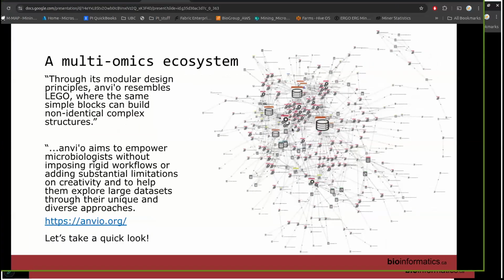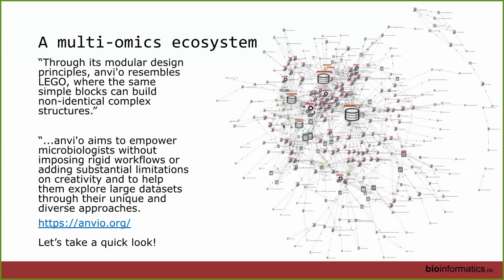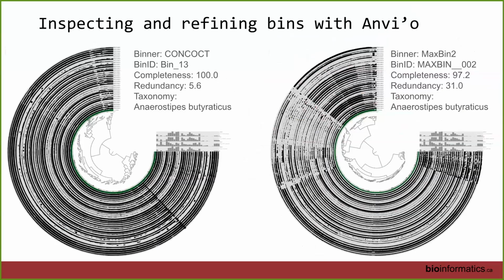Okay, so Anvi'o is cool. We're going to be doing that today. This is a figure that you're going to be creating. Not exactly these figures, but something very similar to these figures. Maybe exactly, depending on what journey you take today during the lab. So what these are is a visualization of a genome, of a MAG, actually. Well, actually, we should call it a bin first because we haven't refined it. Then you call it a MAG after you refined it.